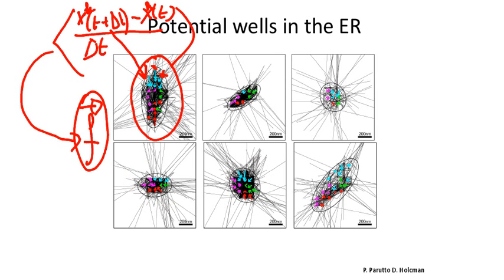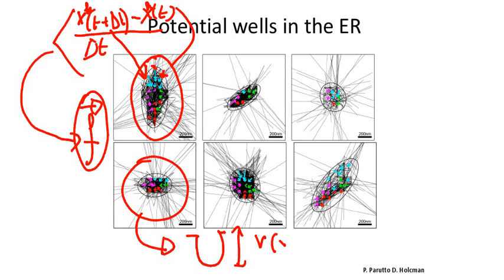And these converging arrows are actually the signature of a structure that is well known in chemistry, which is called a potential well, from which we can calculate a force by using the gradient of this quantity. And this gradient is the force, a virtual force, the origin of which is unclear, which will prevent a trajectory from escaping and bring it back to the center until the trajectory can eventually leave the domain.